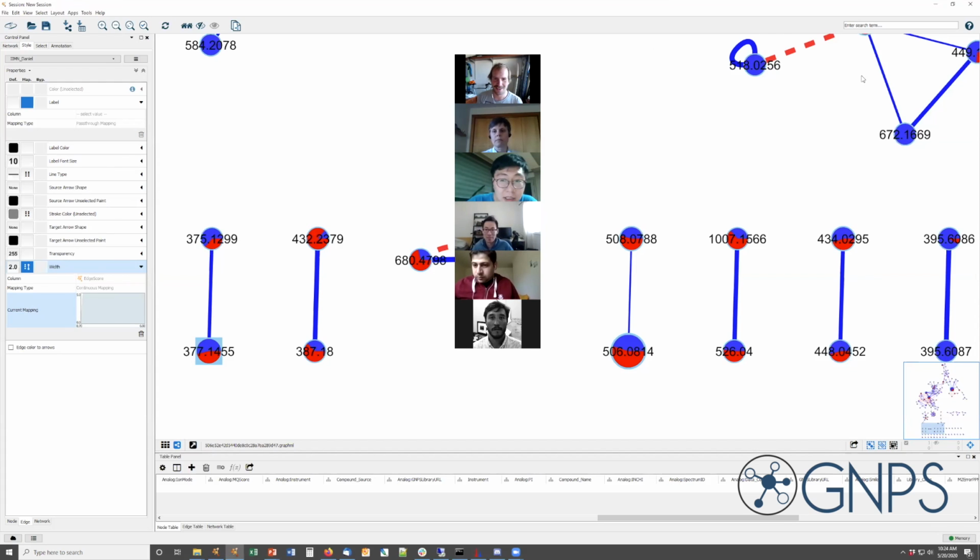Can I ask a question? Sure. Actually, do you guys have any plan to make it possible to look into the ion identity network through the in-browser visualizer? Currently, I can find that it's not visualized in the in-browser visualizer.